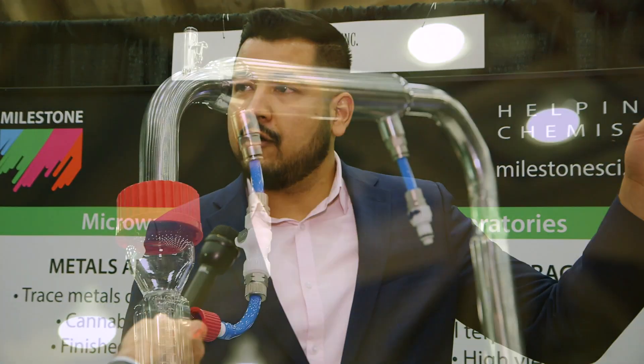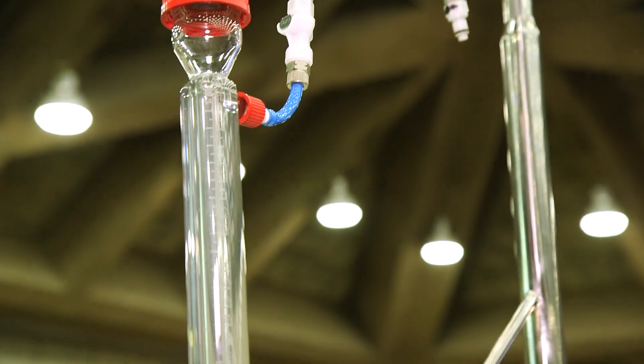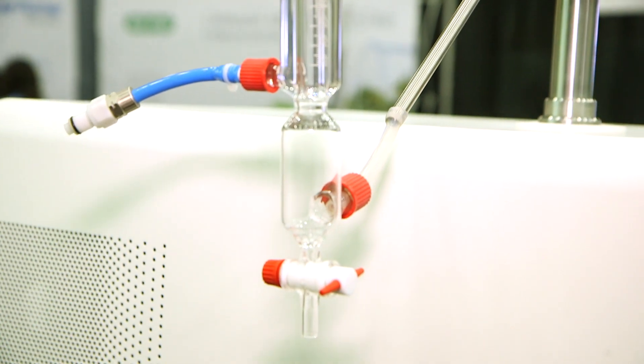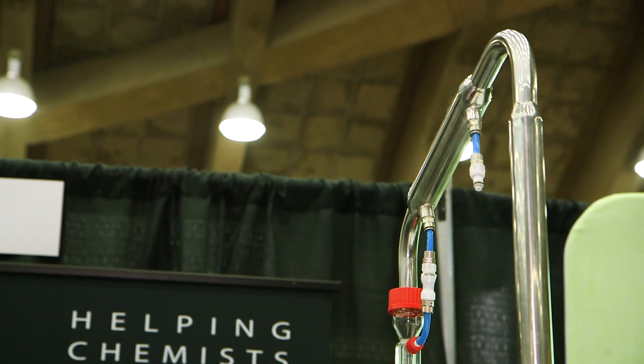Our technology is based on solvent-free microwave-assisted extraction. We take advantage of the water that is already in the plant material and apply a microwave field. The water evaporates and as it does, it carries the terpenes with it. We have this kit here connected to a chiller that actually condenses the water and allows us to recover the terpene fraction in this vessel. At the end of the run, you discard the water and you get a very pure terpene fraction.